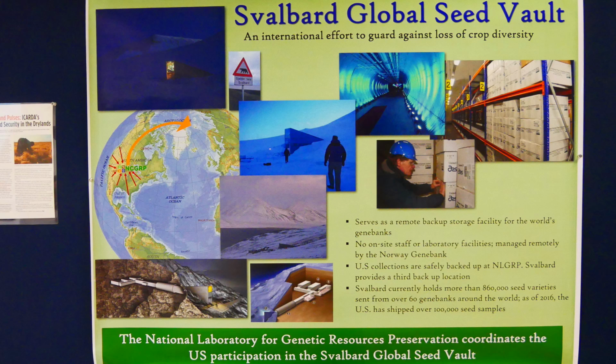And I also learned they only handle the species that are propagated by seeds. Svalbard is the example. Are they storing in liquid nitrogen like this? They've purely got the vault where they're storing the seeds similar to what you're doing, right? Yeah, and it's the beauty of Svalbard. Nature created that perfectly temperature-controlled vault. And so it's just shells. Well, I've never been there. I hope to go for seed storage, yes. So you could not store papaya or avocado or any of those species or any animal samples in Svalbard.